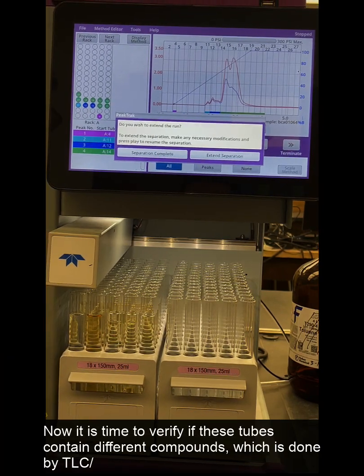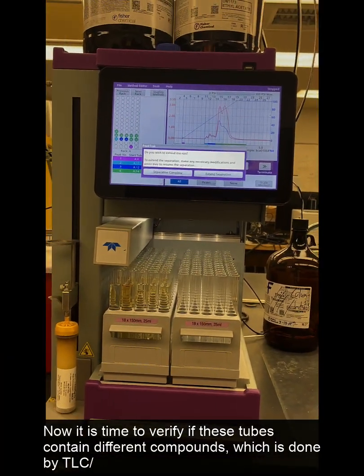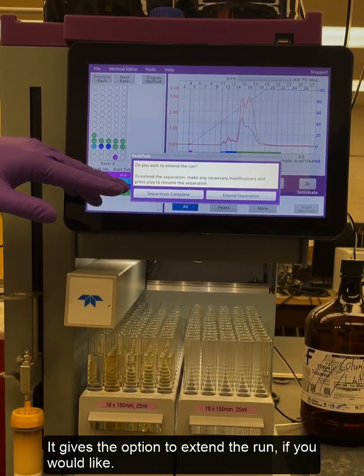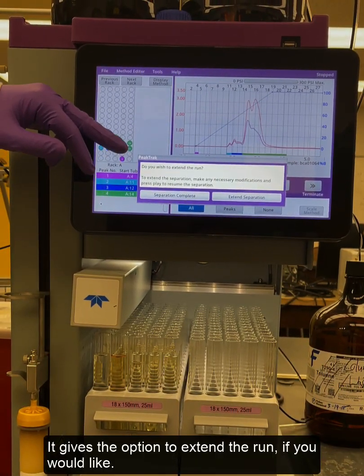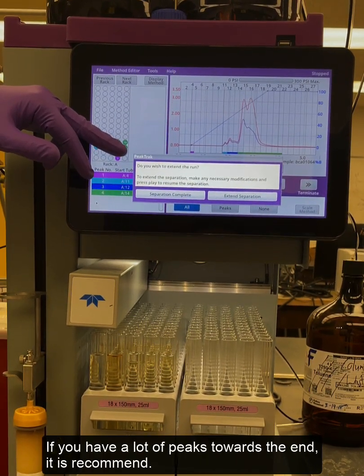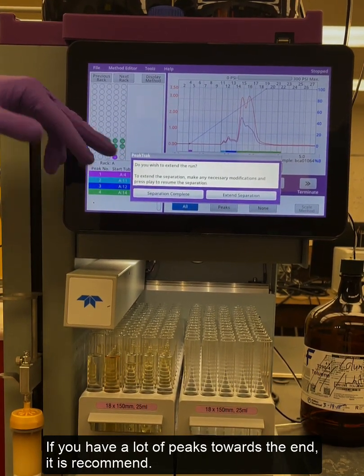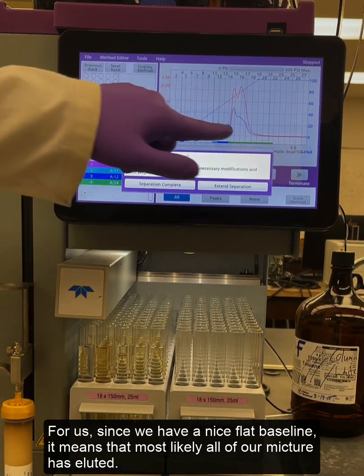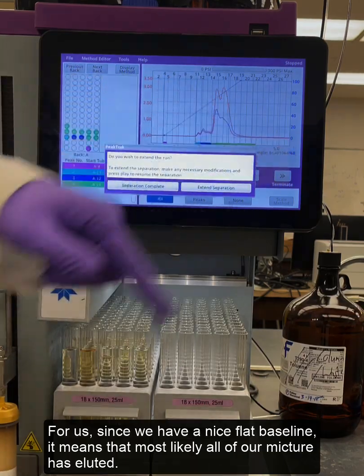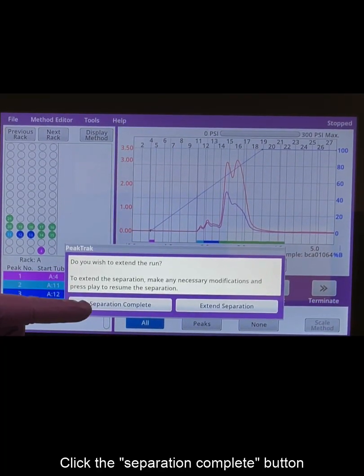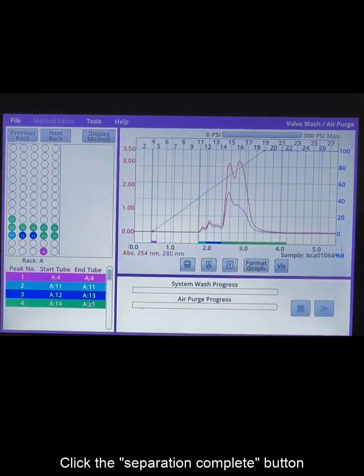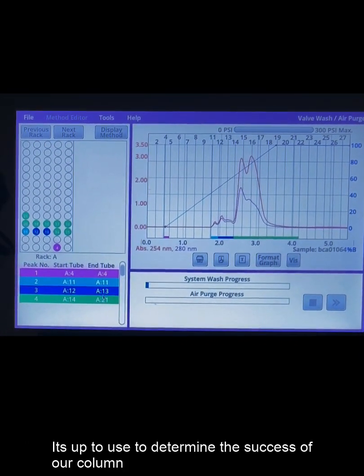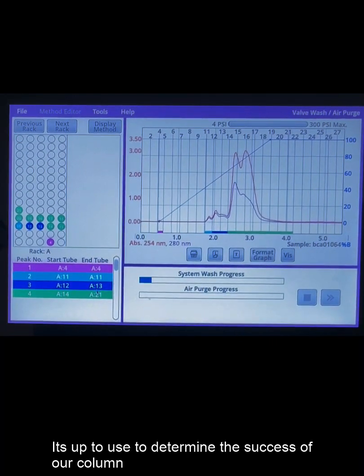Now it's time to verify these tubes contain different compounds, which is usually done by TLC. There's an option to extend the run if we would like. If you have a lot of peaks towards the end it's actually recommended, but for us since we have a nice flat baseline it means most likely all of our mixture has eluted. Click the separation complete button and it will allow the system to do a wash and an air purge. It's up to us to determine the success of our column.